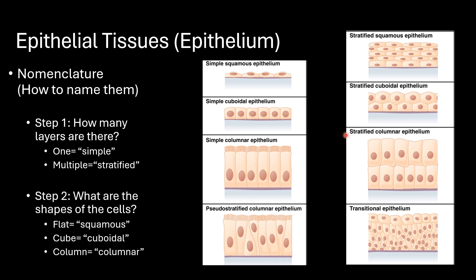The next step is to identify the overall shape of the cells. If they are flat, they're considered squamous. So here we have simple squamous epithelium versus stratified squamous epithelium. Note that we name them based on the shape towards the apex. Likewise, here we have cube shape or cuboidal, or column shape or columnar. There are a couple of odd ones we'll come back to later.